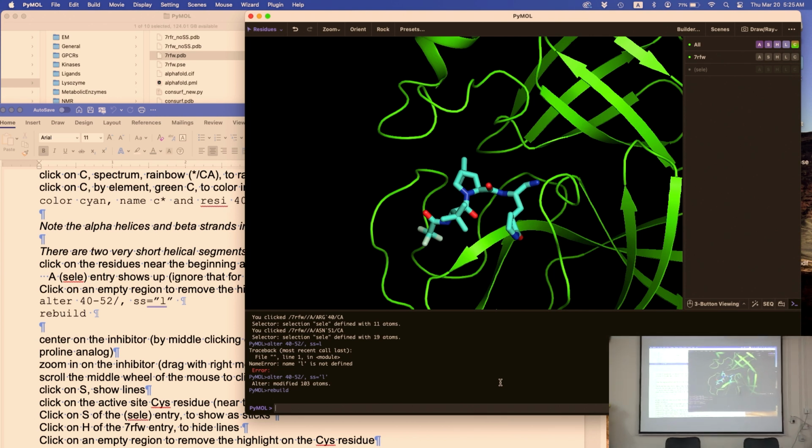The previous one is showing an error. Oh, right. You copy that. Okay, and then return. Oh, I'm sorry. It probably should be a single quote. Try single quote. Yeah, right now it's a double quote. So single quote, L, single quote. Oh, okay. All right. My apologies. So if it didn't work using double quote, use single quote. So in the primer, I have a double quote, which did not work, right? So in single quote, then it should work.